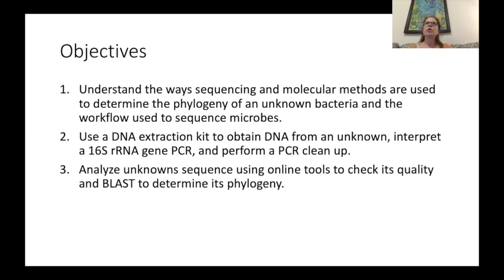If we were in the lab, you'd have the opportunity to use a DNA extraction kit, which allows us to isolate the DNA from the culture. You would do PCR to amplify a particular gene, in this case the 16S ribosomal RNA gene, and you'd perform a PCR cleanup. Unfortunately, you won't have the opportunity to do any of those because those are lab-based work.